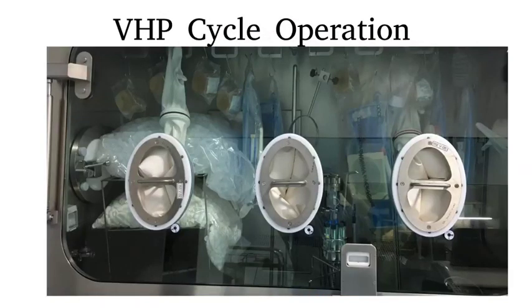Glove integrity testing of all gloves is performed before the start of isolator loading. Then the isolator chamber is loaded as per the qualified loading pattern with the required articles, such as microbial monitoring media plates, and sterilized articles such as rubber stoppers, bowls, scissors, tweezers, wipes, etc.